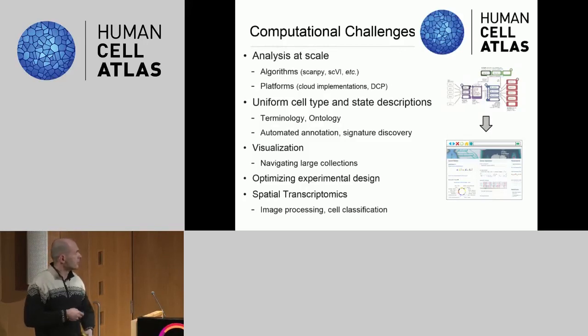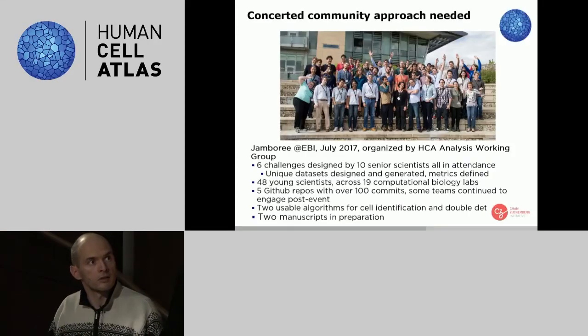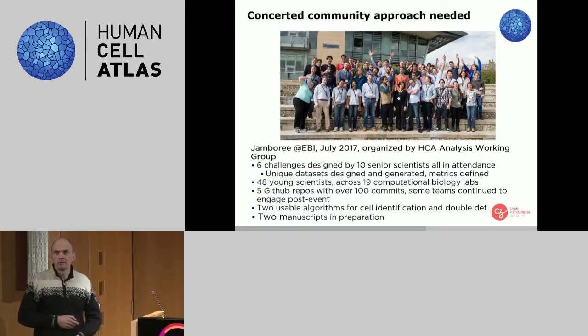In terms of use cases, obviously, optimization of experimental design for both the creation and additional experiments. For instance, if you wanted to compare a disease case with the normal annotations here, these types of computational tools will need to be created. And there are a lot of problems related to integration of spatial transcriptomics and using its potential. So we're hoping to leverage the very active computational community around here, including many students and postdocs.